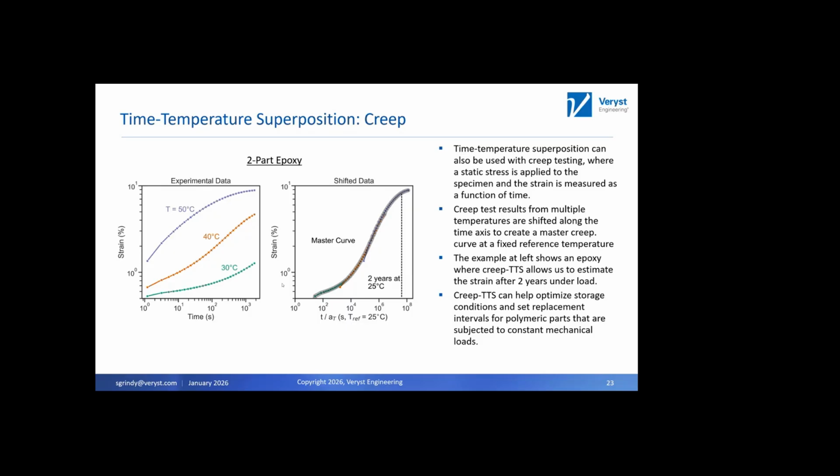And so kind of the general algorithm is you're reducing the total line length based on some function of the shift factors. It is, I'm going to call it 85% a science and 15% an art. This is not something where, for all materials, I would expect a new practitioner to do a good job. And it does take some experience.